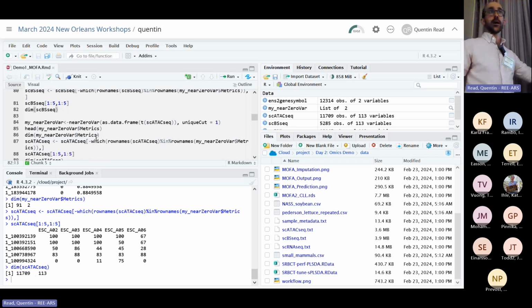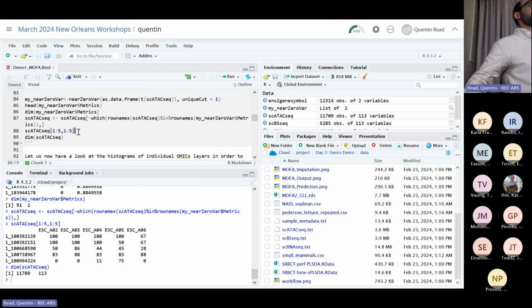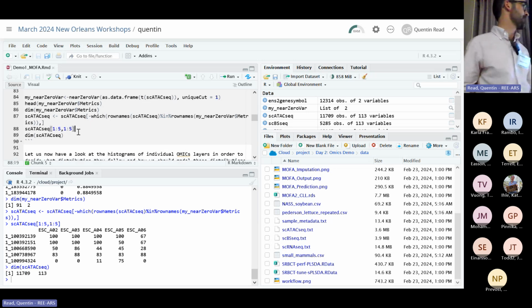Everyone kind of following what's going on? Hopefully, conceptually, we can follow even if you don't know what every bit of code is doing. But so far, this is all fairly straightforward in terms of the code. We aren't doing anything super sophisticated yet.